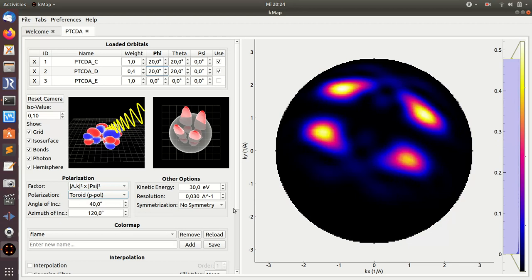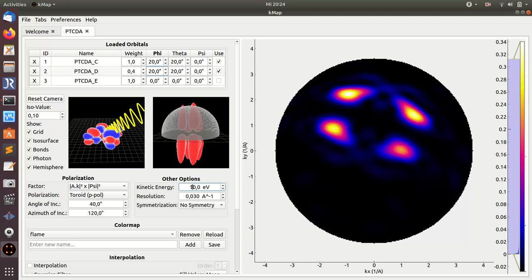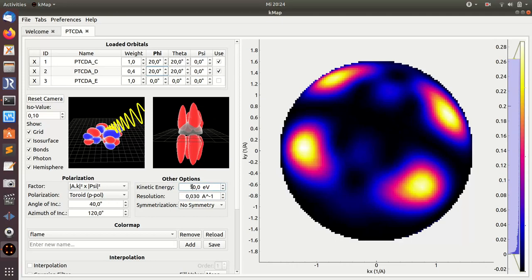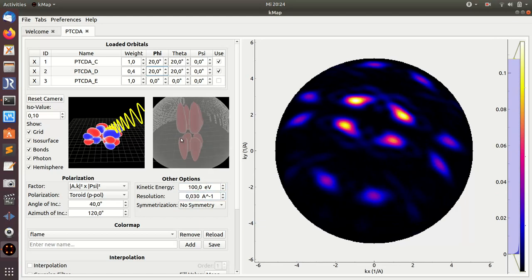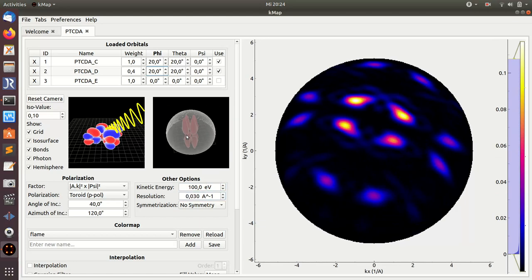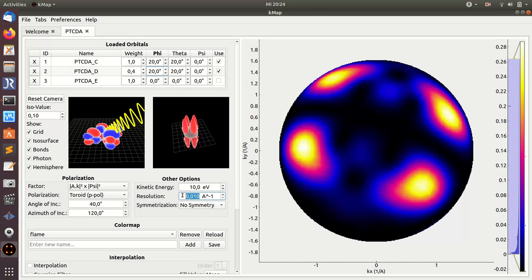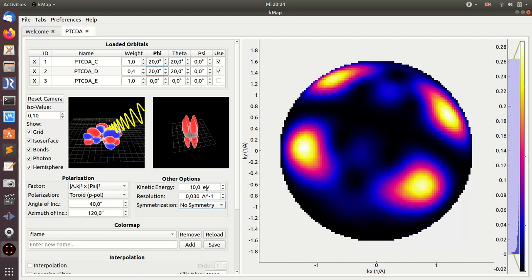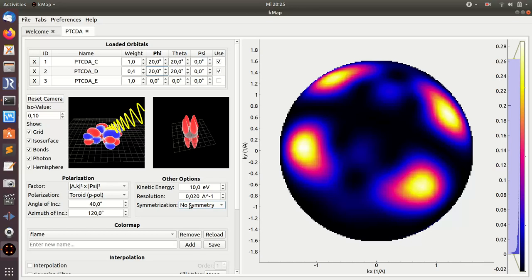What else can you do on this orbital data tab? You can choose the kinetic energy, which you also see here. The hemisphere cuts larger or smaller depending on which value for the kinetic energy you're choosing here. You can also change the resolution in k-space. Maybe you see better if I go to smaller kinetic energy. You can change the resolution in momentum space.